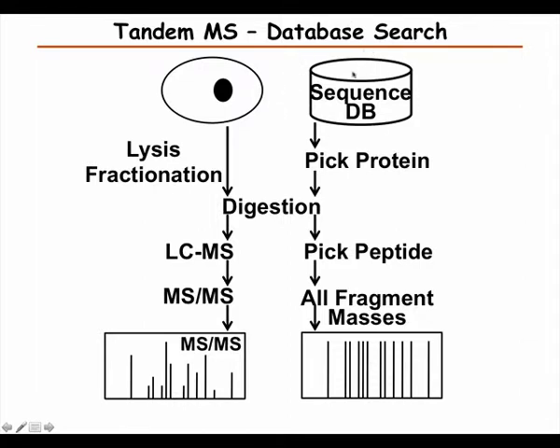So in the computer we have a sequence database. Of course, we should construct this sequence database so that it contains all the relevant sequences and nothing else. That would be ideal. Usually we don't know exactly how to do that, but we, for example, take all the human proteins from the reference sequence. We actually know that every human has variants, so some amino acids will be different. But usually we just ignore that, and in most cases that's not a problem.